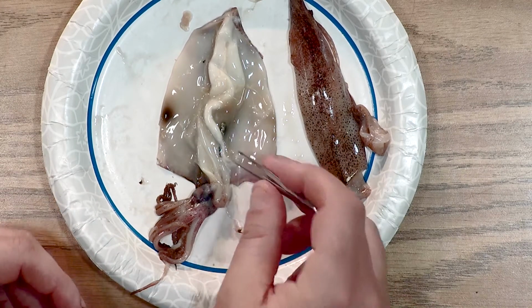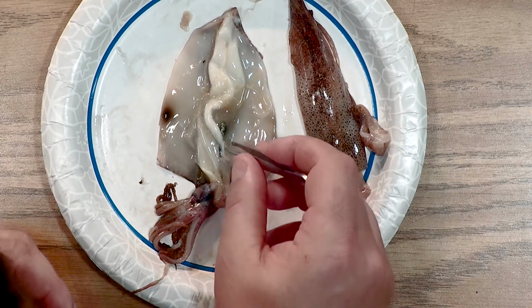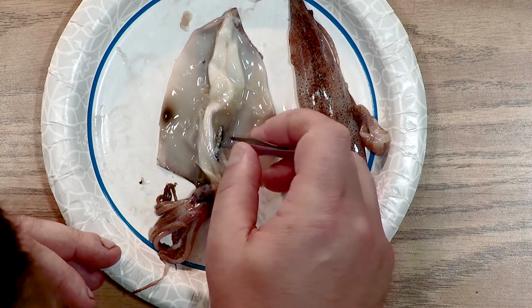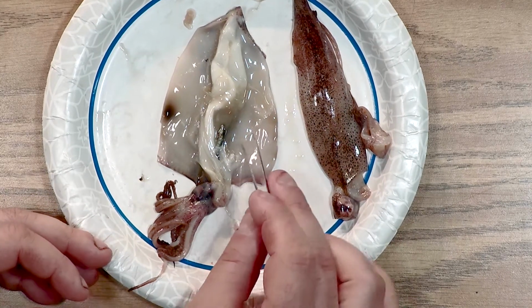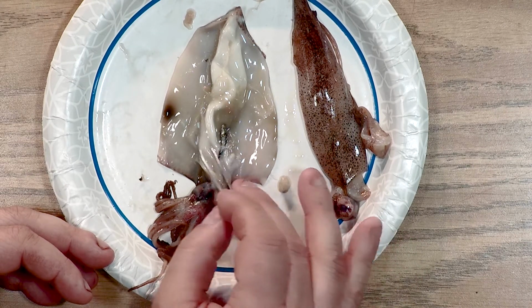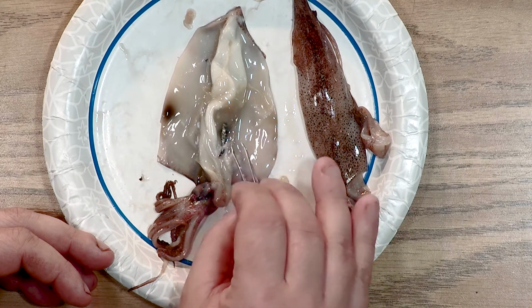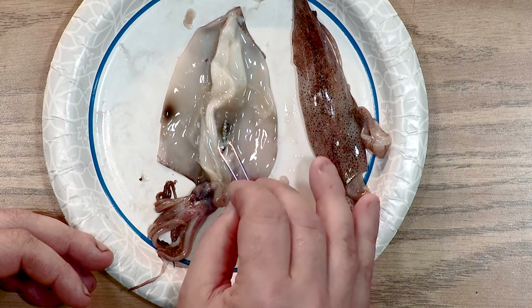First thing I want to point out, we talked about that ink, the ability to have the ink. Well, right here, I'm going to move this piece out of the way. You can see a shiny, once again, I'm going to use that word, iridescent or metallic looking object. And that is the ink sac right here.